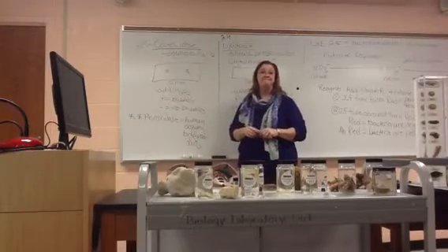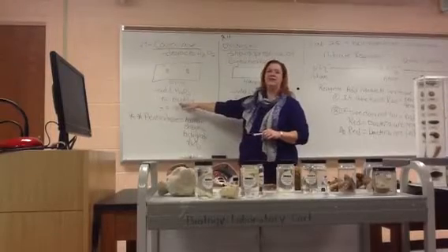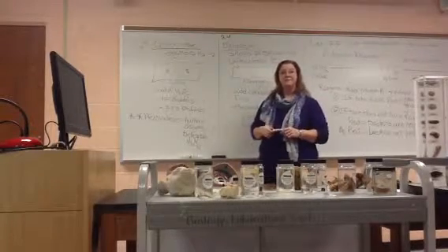Yes, ma'am? What did you say, the positive? I have it, yeah. But it's right there. Well, no, that's the physical, right? Right, that's what it looks like. What we're trying to find out is, do they make catalase or not? Does it produce catalase?